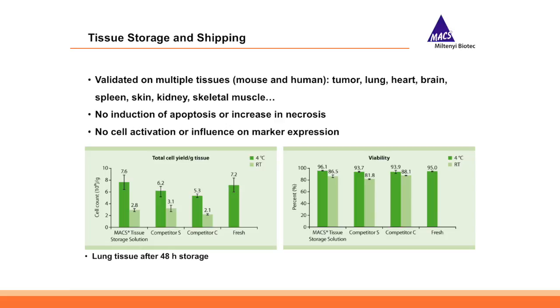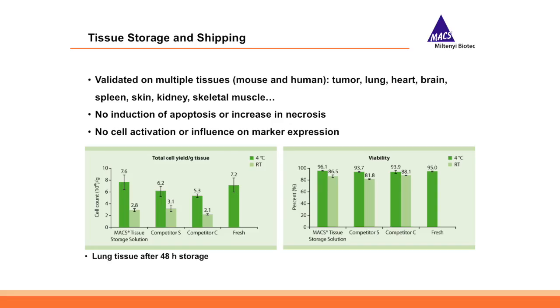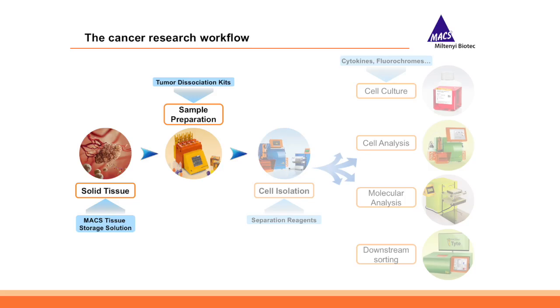This solution did not induce apoptosis or an increase in necrosis, and we didn't see any cell activation or influence on marker expression. We then need to dissociate the tissues to prepare the sample.